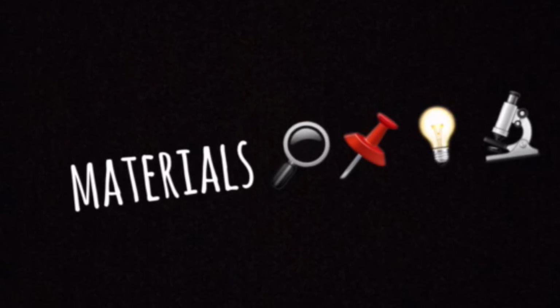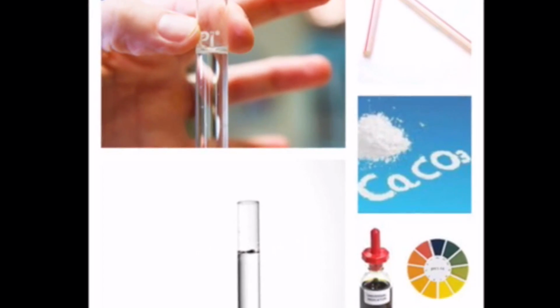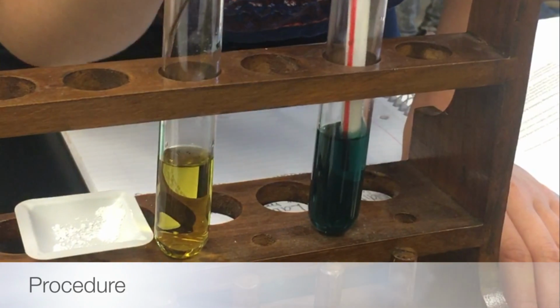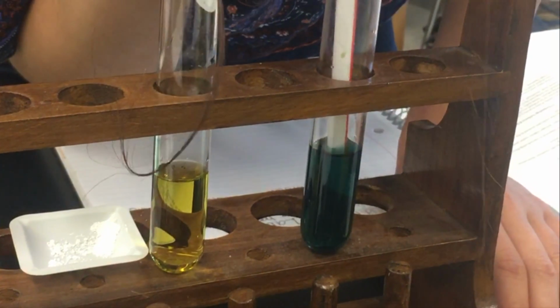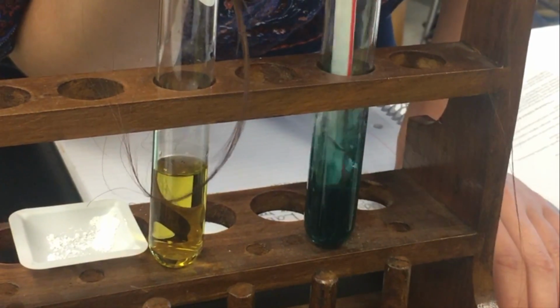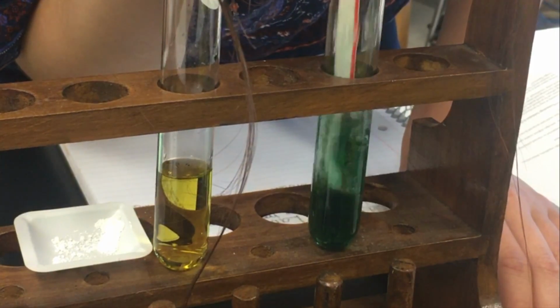The materials needed for this lab included 5 drops of universal indicator, 10 milliliters of ocean water, 10 milliliters of distilled water, a straw, and 0.1 grams of calcium carbonate. Now to begin the procedure. Using a straw, Desiree slowly breathes carbon dioxide into the test tube containing ocean water. Meanwhile, someone else in the group is timing how long it takes for the pH to change, which is demonstrated by the color change in the water.